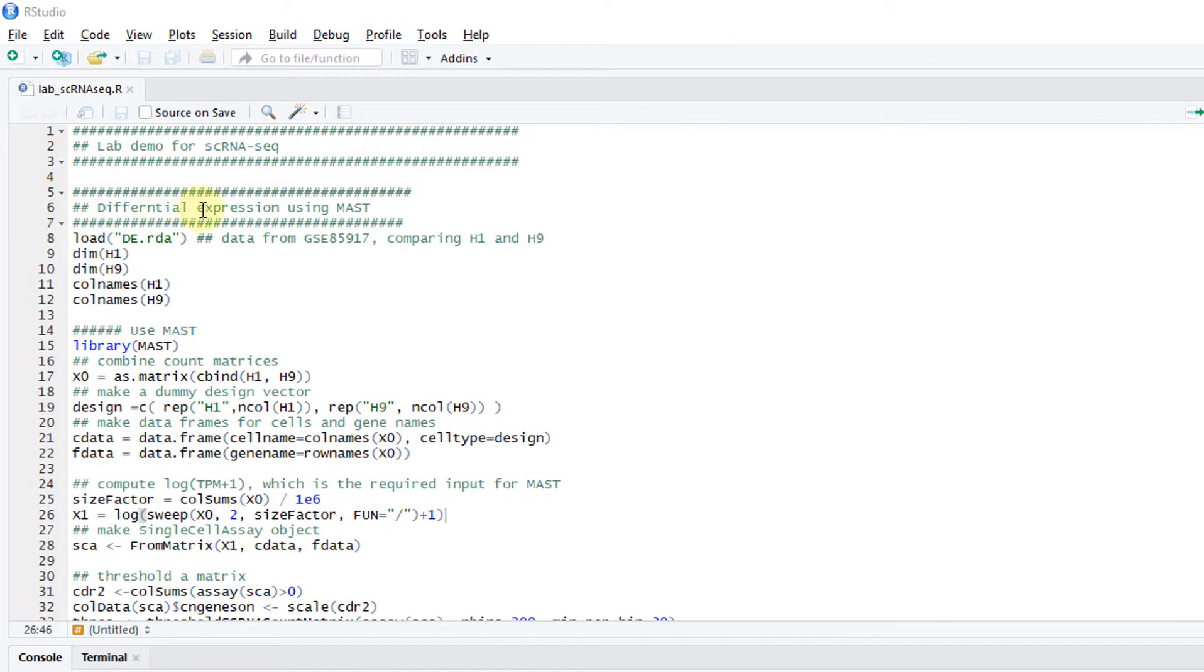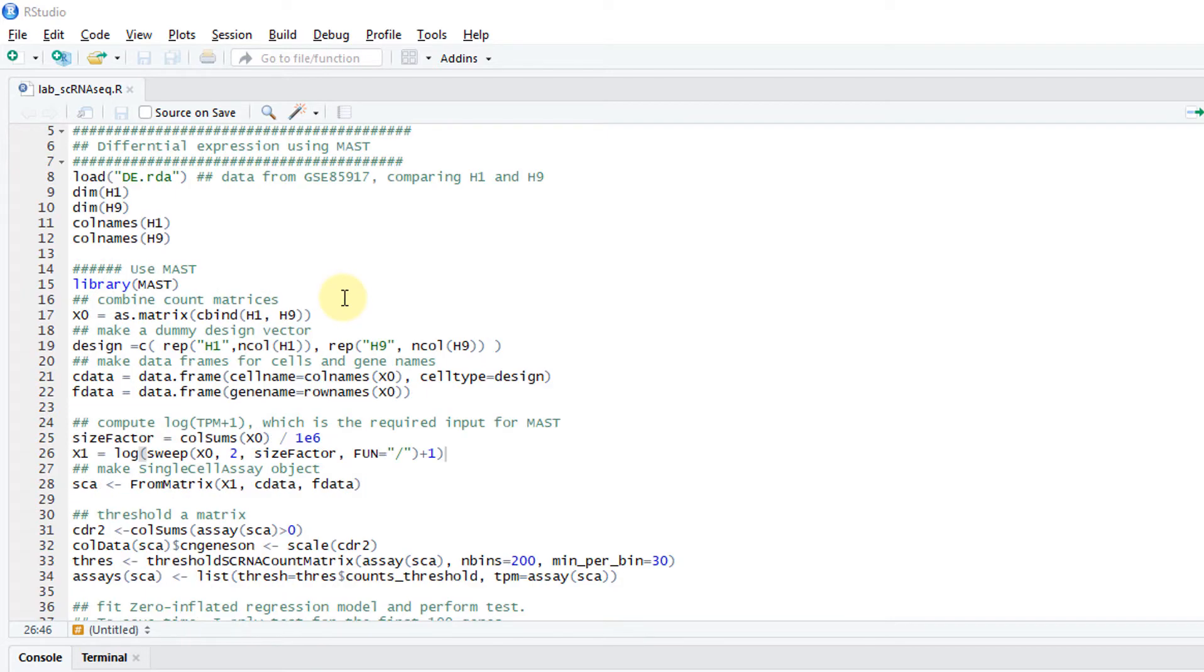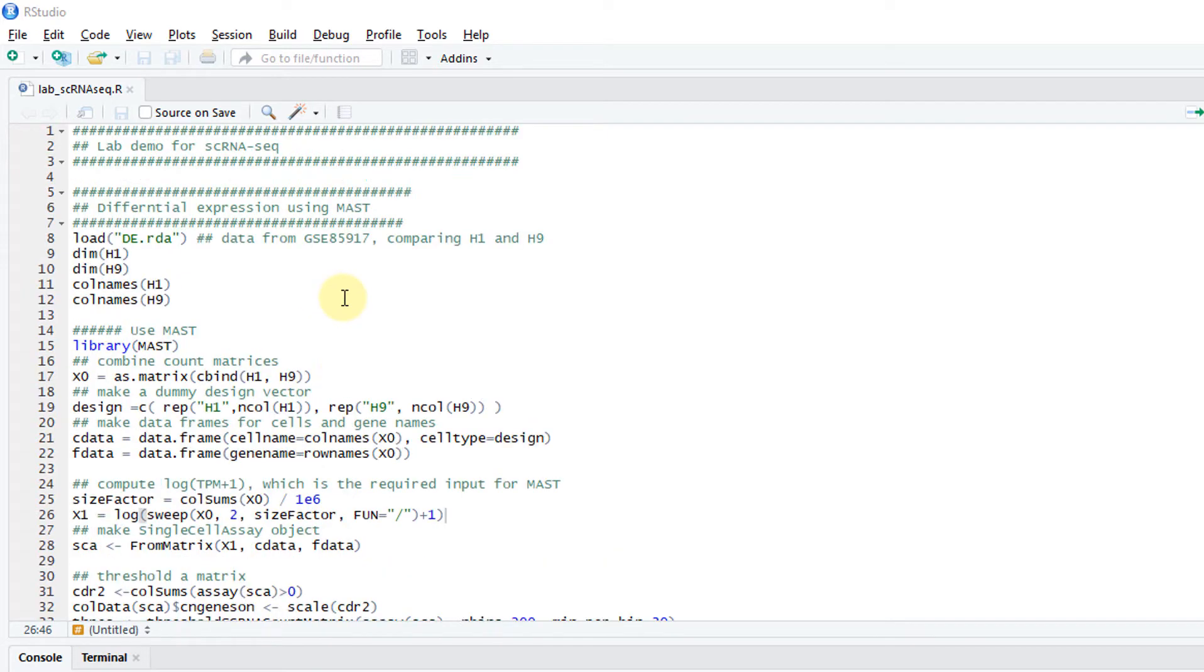In this lab, I'm going to show you how to do some simple single cell RNA sequencing data analysis, including differential expression and cell clustering.